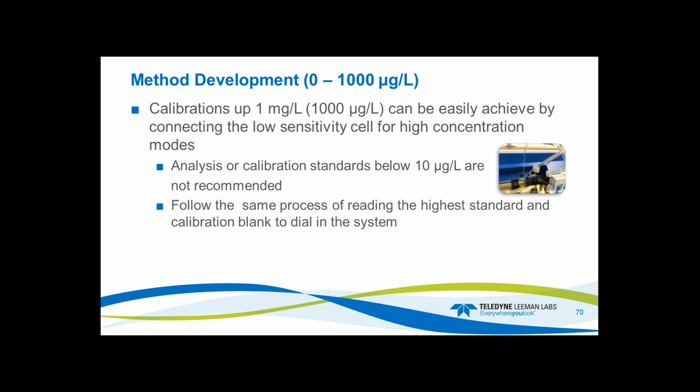So we can easily achieve that by connecting the low sensitivity cell for high concentration modes. So the analysis or calibration of below 10 ppb is not recommended in this method. So you want to follow the same process of reading the highest standard and the calibration blank.